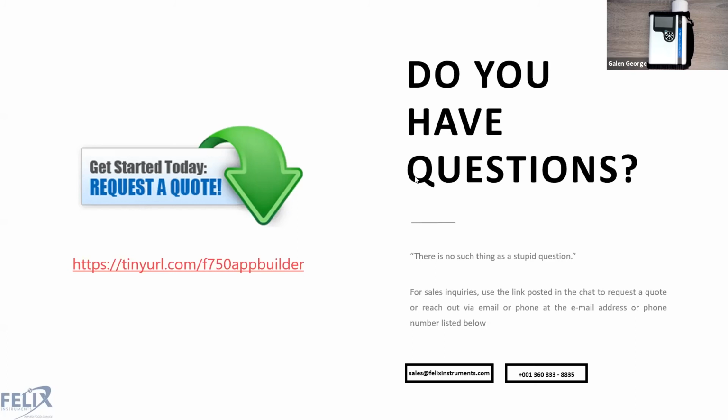But the only caveat is that in order to then deploy that model onto a device that is not a Felix Instruments device, there might be a little bit of modification that needs to be done, a couple of extra steps. So if this is something that you are hoping to do, I would ask that you reach out to us first, and we can maybe have a video call to see if this is going to be possible for you.